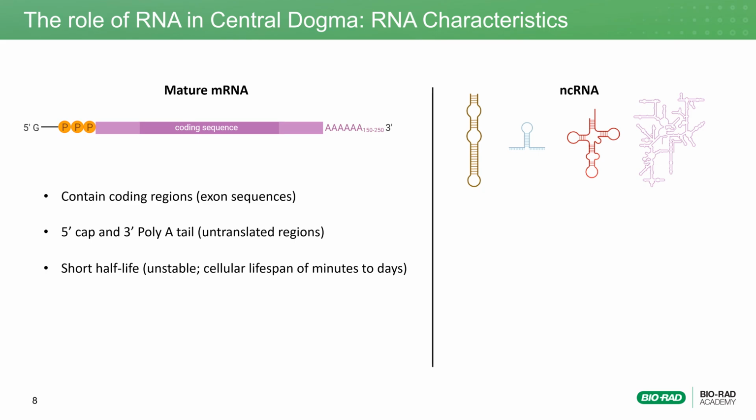However, even with these stability buffers, mRNA has a very short half-life of minutes to days, which is why scientists are extra careful when handling it in the lab, something that we'll touch on later.